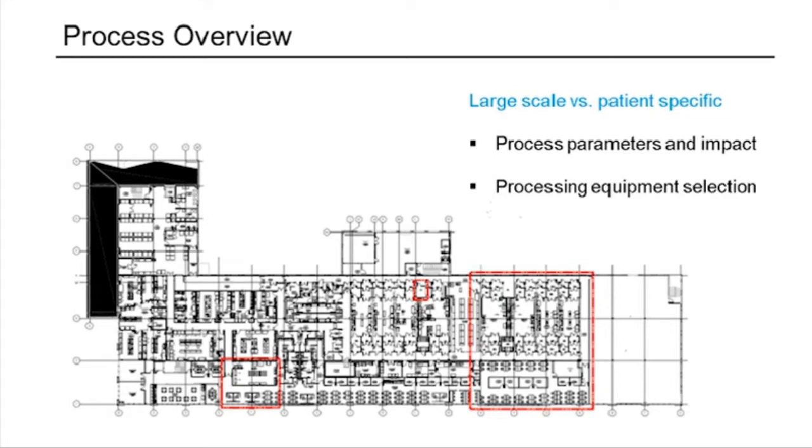Or cold chain, certainly, if you're just refrigerating, the cost implications of doing cold chain for a 1 or 2 liter batch versus a 1,000 or 2,000 liter batch can have dramatically different consequences for your facility. And then, as we'll go into later, there's typically very different equipment offerings in terms of processing equipment for the different scales, personalized scale versus large scale, and each of those carry their own implications as well.